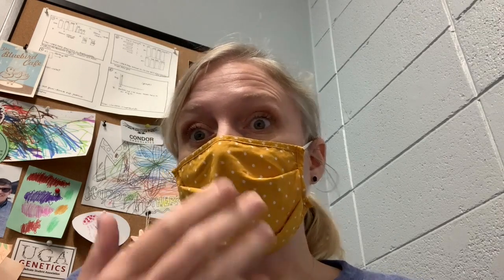So in the lab, you're going to do a lot of different things. You may do cloning, you may generate riboprobes, you may generate double-stranded RNA, you may generate PCR products, you may purify RNA. You may do any number of things, even things that we haven't even done yet, you may be responsible for doing. And so in the course of all of these things, you're going to generate physical products.